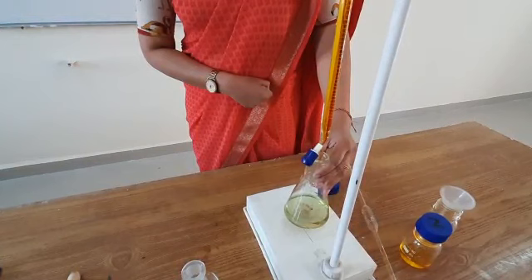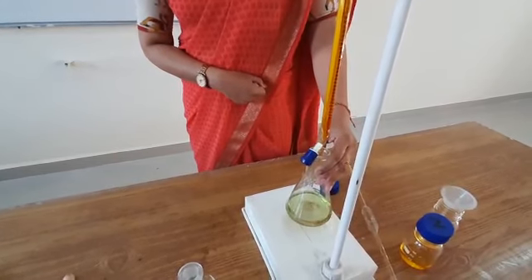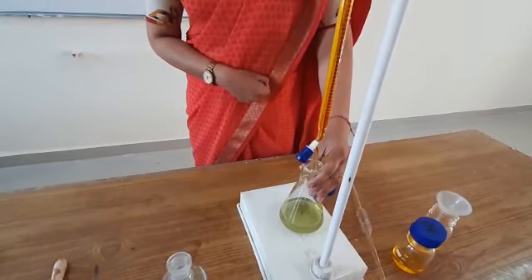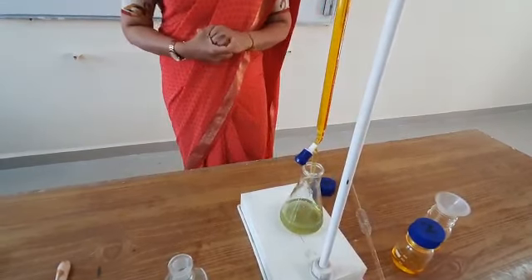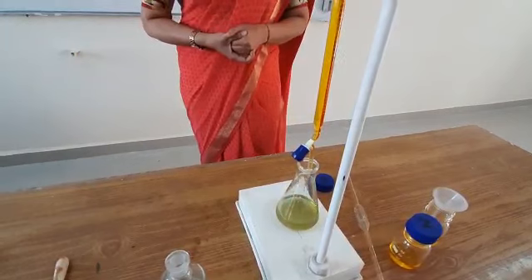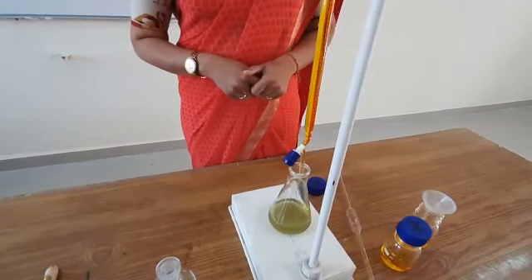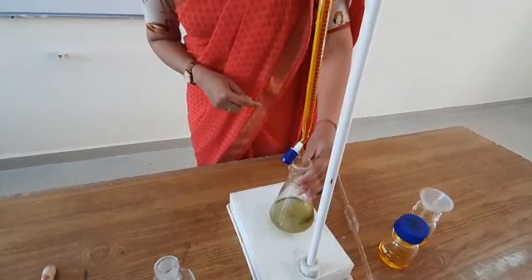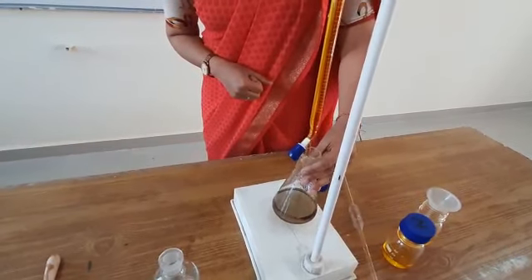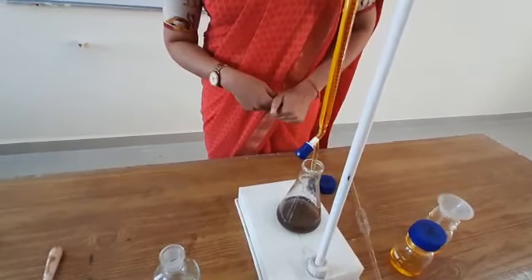Until all the iron is oxidized, the dichromate will be consumed. Around 17 ml has been consumed so far. I will get the purple color soon — and as you can see, this is the endpoint of the titration. We have obtained a dark bluish-purple color.